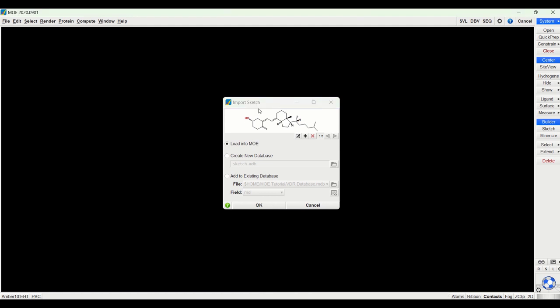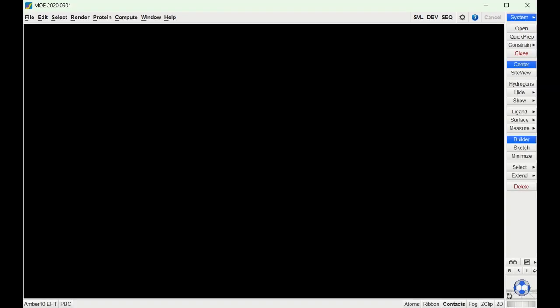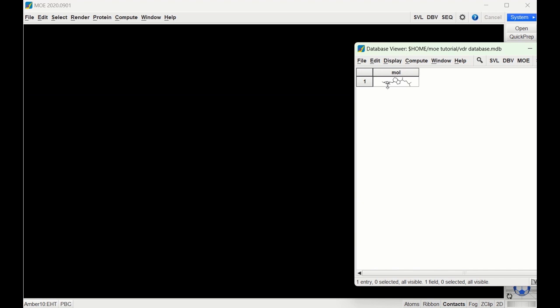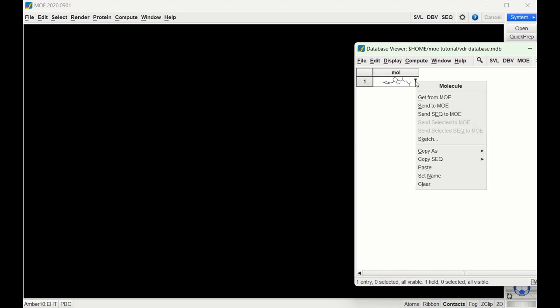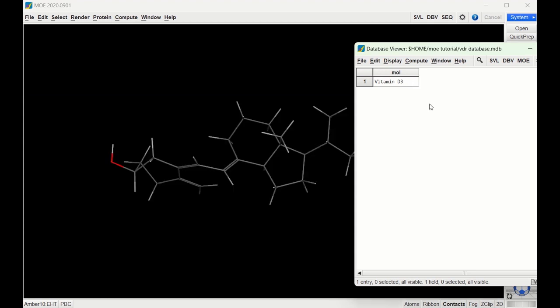Once I have it drawn, all I need to do is close out of ChemDraw and it will send me back to MOE. You can see here it has the structure pulled up — all I need to do is click OK, and then it should add it to the database. You can see when I pull up the database it has the structure added. So now I can go ahead and name this by clicking the dropdown and clicking Set Name. I'm going to call this vitamin D3 and hit Apply and it changes the name.